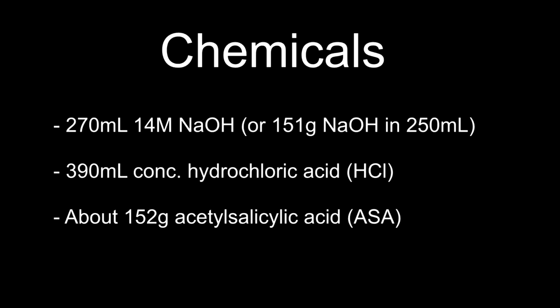For this experiment, I used 270 milliliters of 14 molar sodium hydroxide. You can also prepare your own using 151 grams of sodium hydroxide and dissolving it in 250 milliliters of water. I also used about 390 milliliters of concentrated hydrochloric acid and 152 grams of acetylsalicylic acid that was obtained in the previous extraction video.